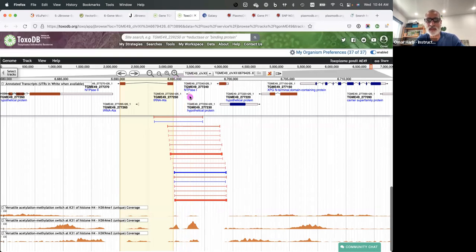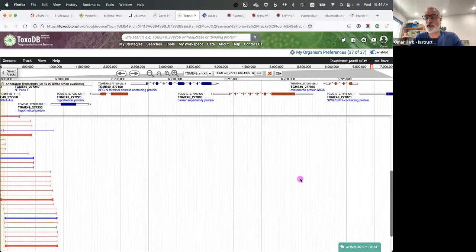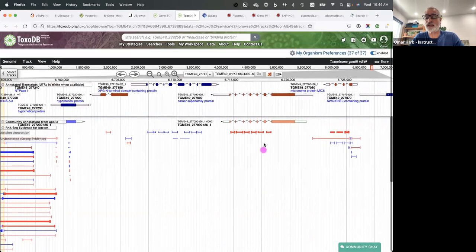So this is interesting, but you'll also notice that there are these other potential tRNA genes right here. And so maybe these are marking where the tRNA genes are. And so it gets very complicated, but using this data in combination, I probably picked one of the more complicated genes to look at to try and annotate, but using this different information, and we'll do that in the breakout rooms, you'll be able to then come up with some conclusions about the potential annotation of a particular gene.